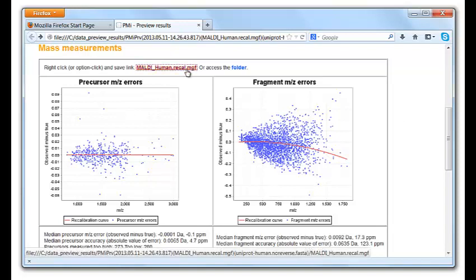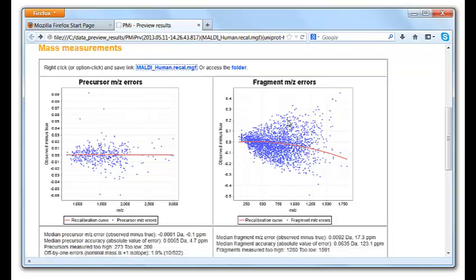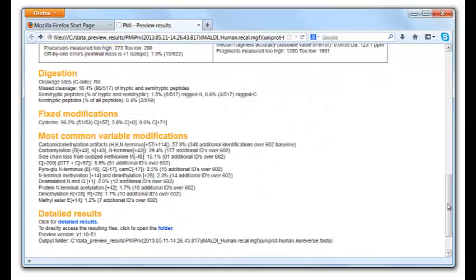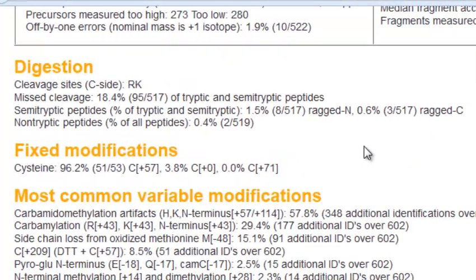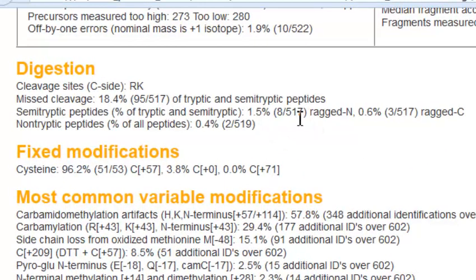Preview writes out the recalibrated MGF file here, and you can use this as input to Byonic or any other search engine. Lower on the page, Preview reports on the completeness and specificity of the digestion. Here we see excellent digestion — less than 2% of the 517 identified peptides were nonspecific at the N-terminus, and less than 1% nonspecific at the C-terminus.